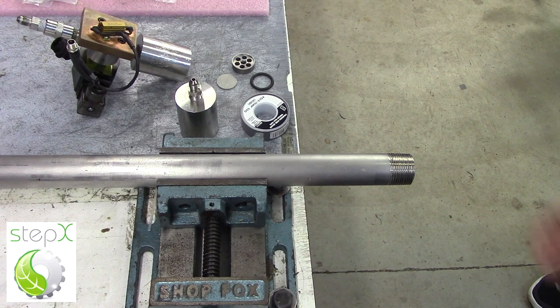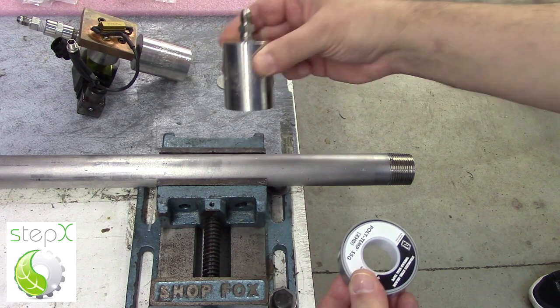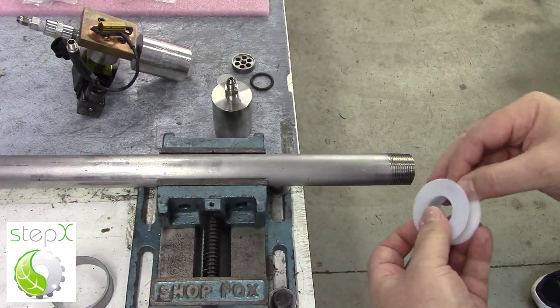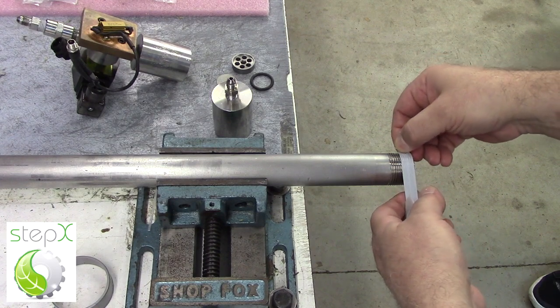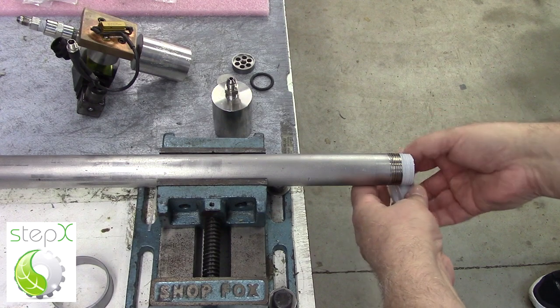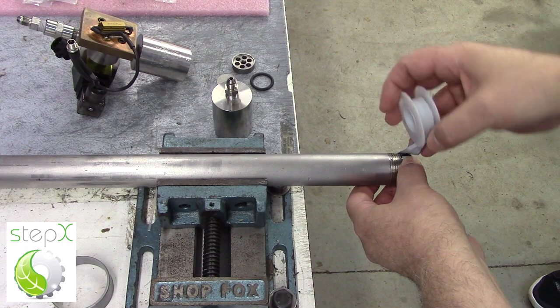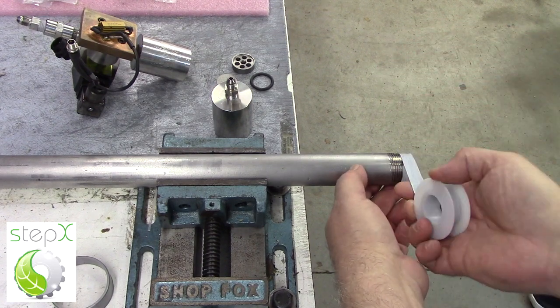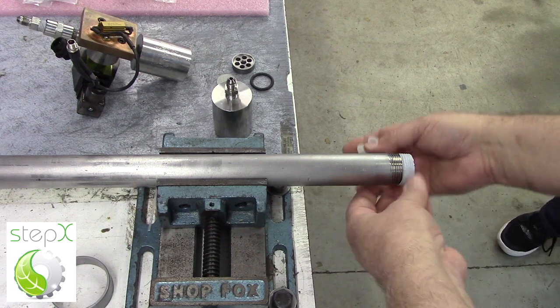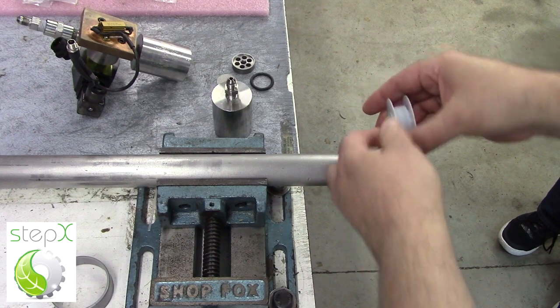The first thing we're going to do is load the reactor vessel with material. We're going to put on a cap using special Teflon tape to prevent galling — meaning that the cap would be welded to the pipe. This just acts as a lubricant and it also helps with sealing.